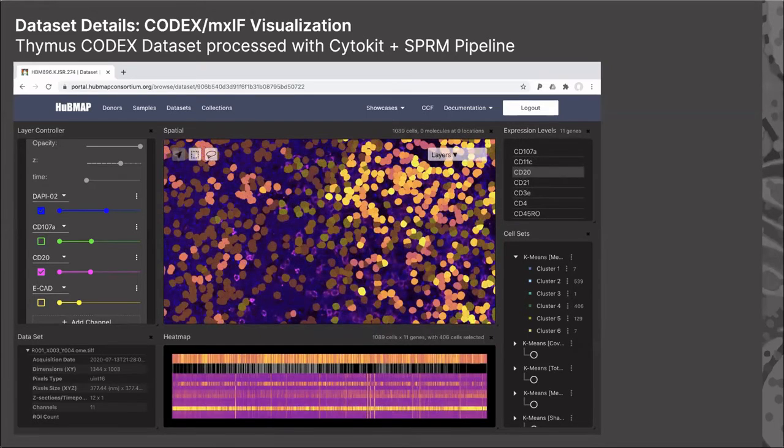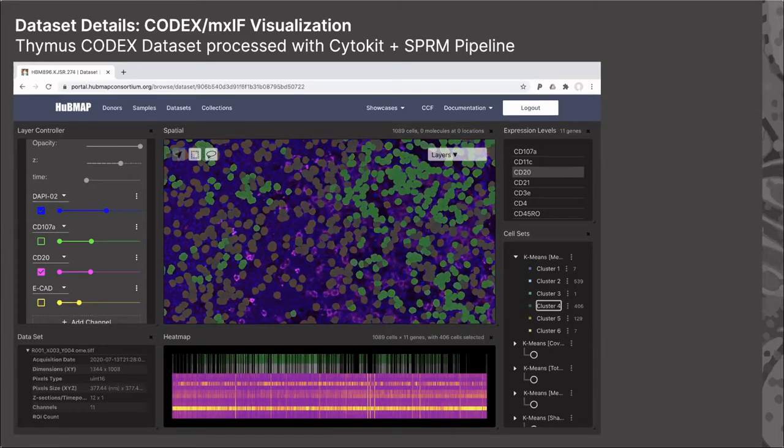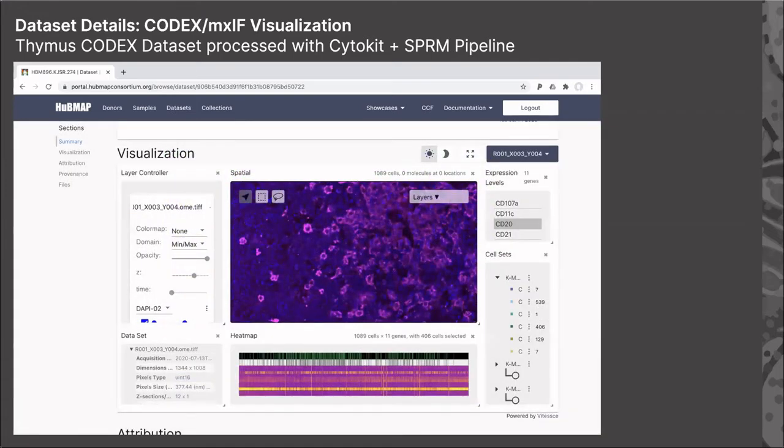Here, I've turned on the gene expression levels once again, just to show you what that pattern looks like for CD20 for the selected cluster. Sorry, again, these are not gene expression levels. We are in the process of changing the label to avoid further confusion here. And again, it maps to the colors of that cluster. And here we can make it smaller. In this case, I just selected CD20 and DAPI, so you can see again how that is distributed in the image.